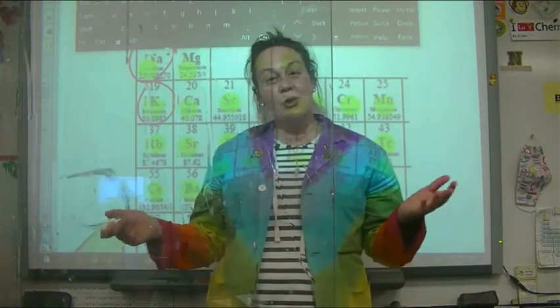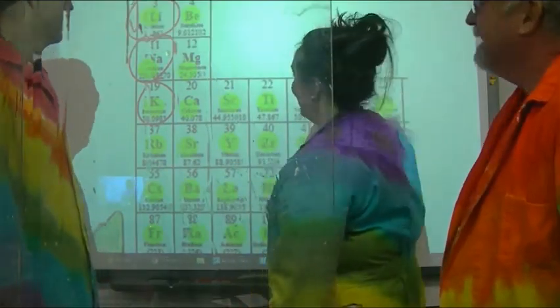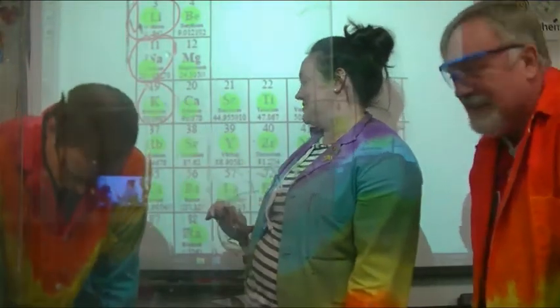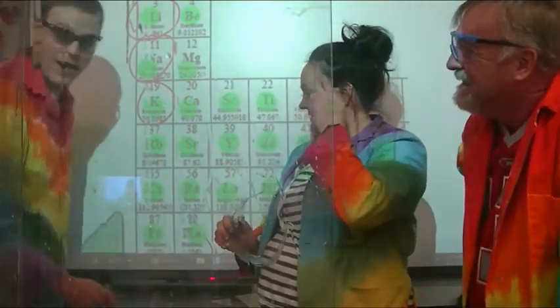So that was a little more reactive, wouldn't you say, Mr. Pilcher? Yeah, no, I would. All right, so here we go. If you thought potassium was a lot, we could get some rubidium. Nope. And some cesium. Nope. Maybe some francium. Yeah, if you want the feds to find you, here you go, francium. Go get some of that.